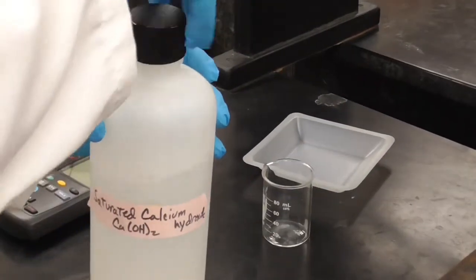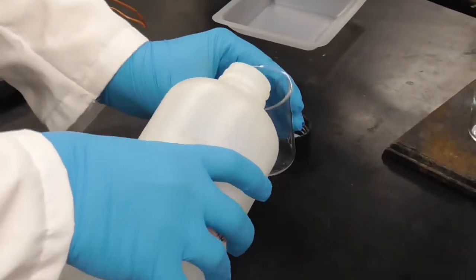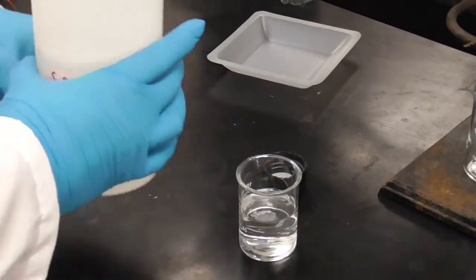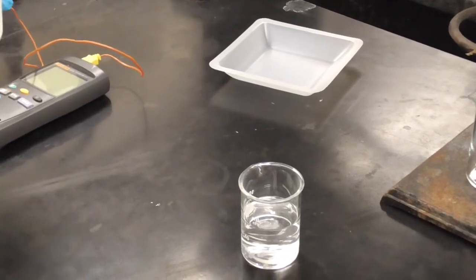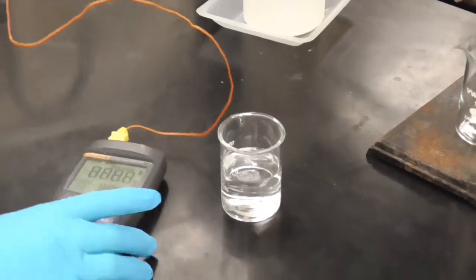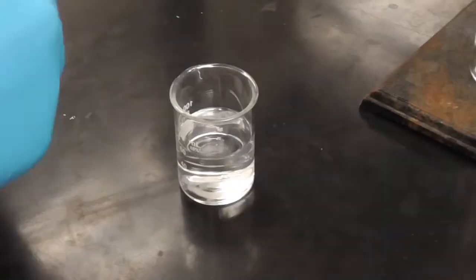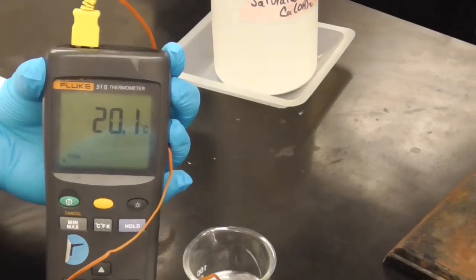And I'm going to pour some into this beaker. 50 to 60 milliliters or so. Okay, we've got plenty. And then it says record the temperature. So we've got our temperature probe here. Get this cord out of the way. All right, and we're going to take the temperature of the solution.